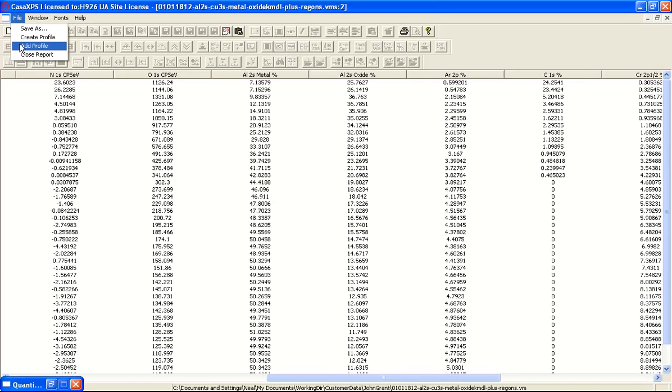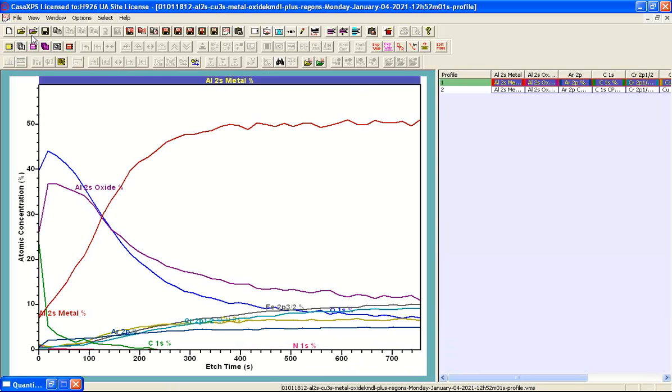One of them literally says create profile and what this will do is create a new VAMAS file that contains traces that have been calculated from the entries in the table.